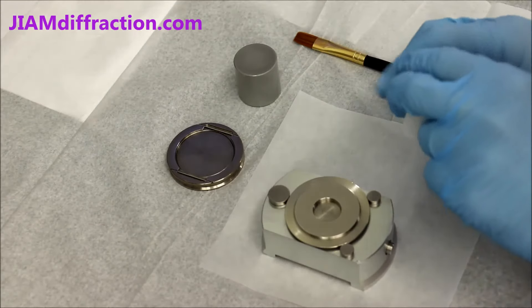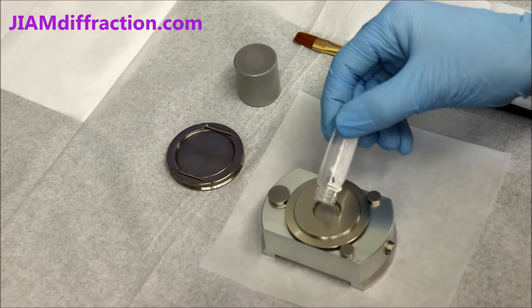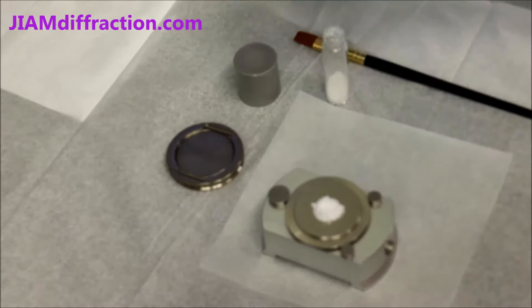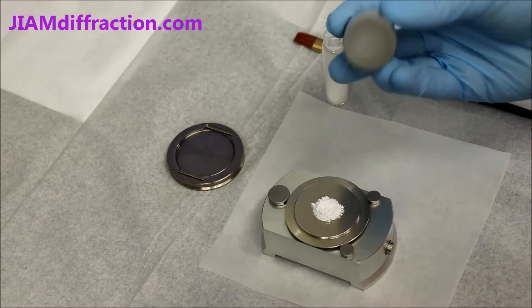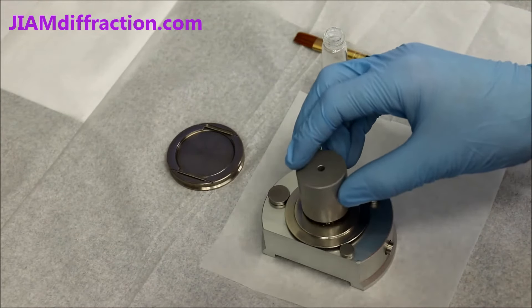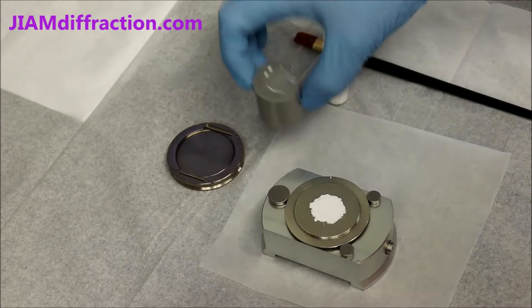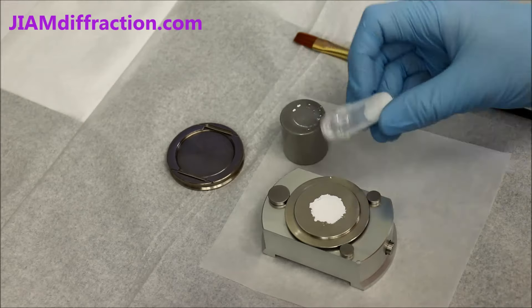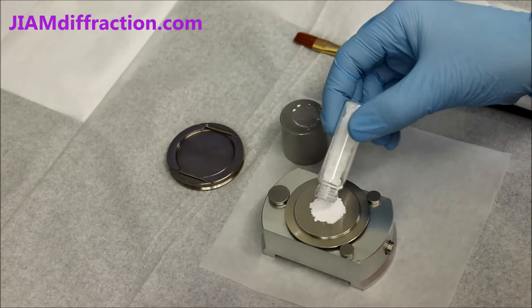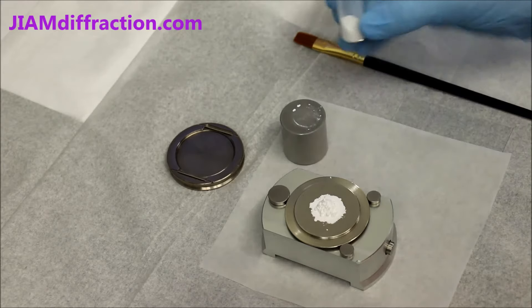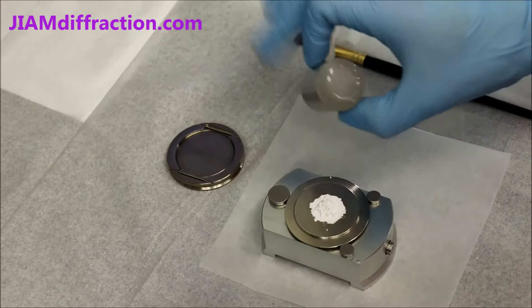We then take our sample and fill the well, and we will actually overfill it. I'll then take the pressing block, press down firmly and evenly, then add a little bit more powder, and press down again.